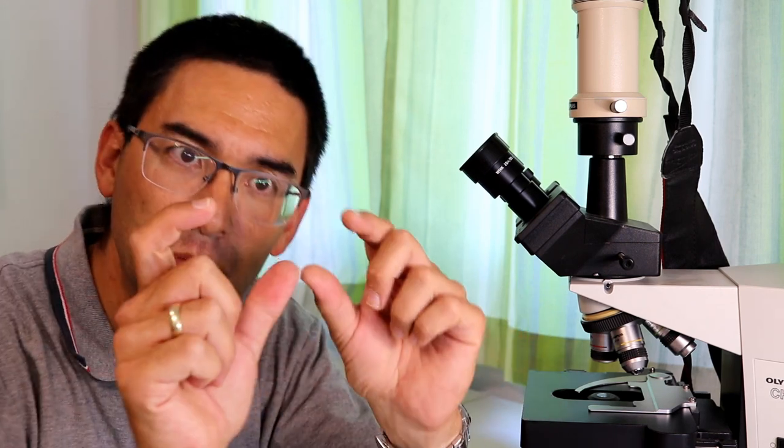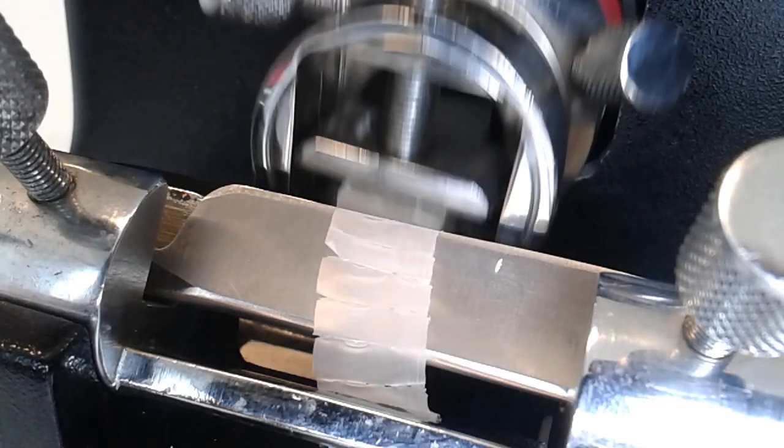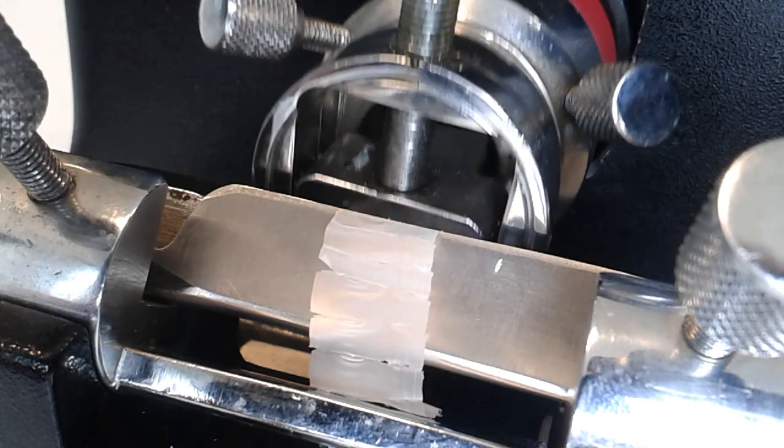As I already mentioned, the problem with large specimens is always that they have to be processed first in order for them to be microscopically observed. After all, the microscope slide is only that size approximately and there's not a lot of space there. Traditionally what you can do is take a piece of the specimen and then you have to process it, you have to dehydrate it and you have to microtome it. Microtome means that you have to cut it into very thin sections before you're able to mount it on the slide and then you can observe it under the microscope.